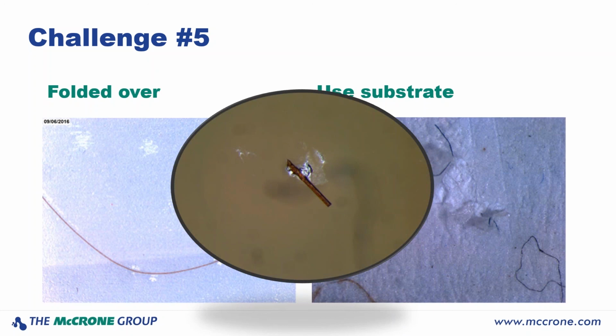Most adhesives are acrylate-based, and it's very possible that in subsequent analysis we're going to see evidence of an acrylate. And this would be reported as, we found this material and some acrylate, possibly from the adhesive, because we know it came from adhesive. But that might be erroneously excluding information if there is in fact an acrylate in your sample. Acrylic fibers, of course, are going to have acrylates in there, and certain other polymers as well. So you need to be aware of when the matrix is contributing information and when perhaps assuming it's from the matrix is not helping you.